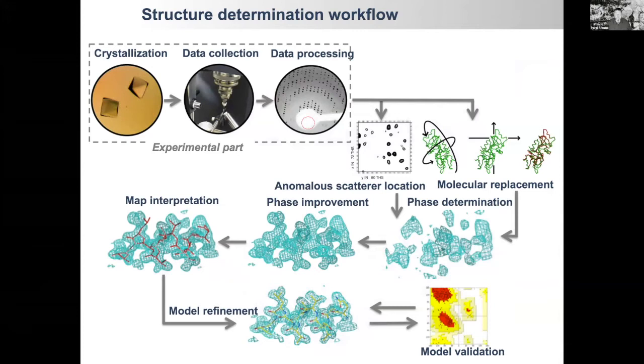Now, just to put things in a bigger picture, that's an overall crystallography workflow, right? So basically going from crystallization data, solving phase problems, something that Randy and team and Tom talked about yesterday, building model, improving maps, building model, and toward the end, once you have your model very close to fitting the data, that's where refinement comes into play.